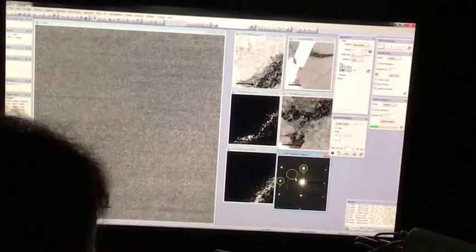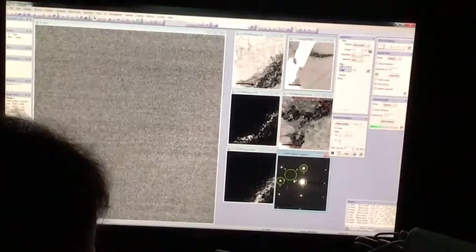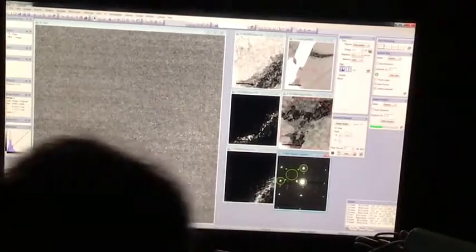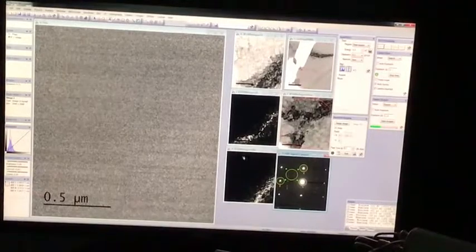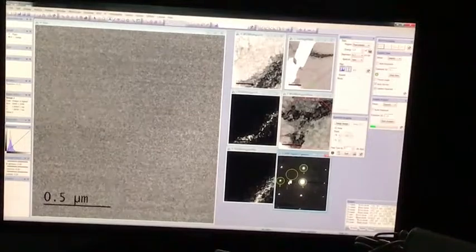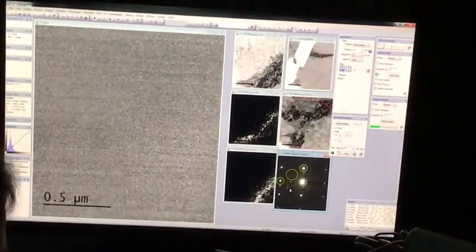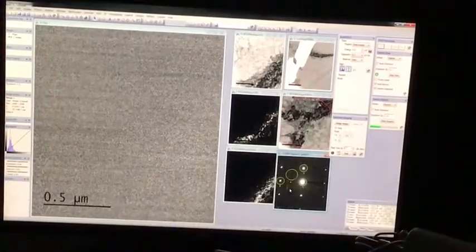And I've got these reflections in here. And that is position 4, and I'm not going to do the reveal until I've marked it all up, because I think you'll like what you see. Oops. That's position 4.